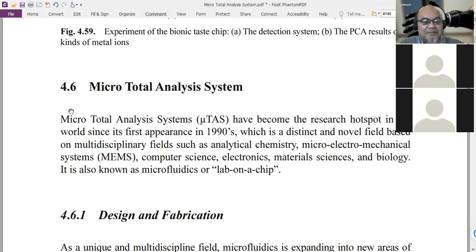But for wax, I have one of my students who did it using wax and acrylic. Unfortunately, it's not published. But we have never tried yet to use epoxy.